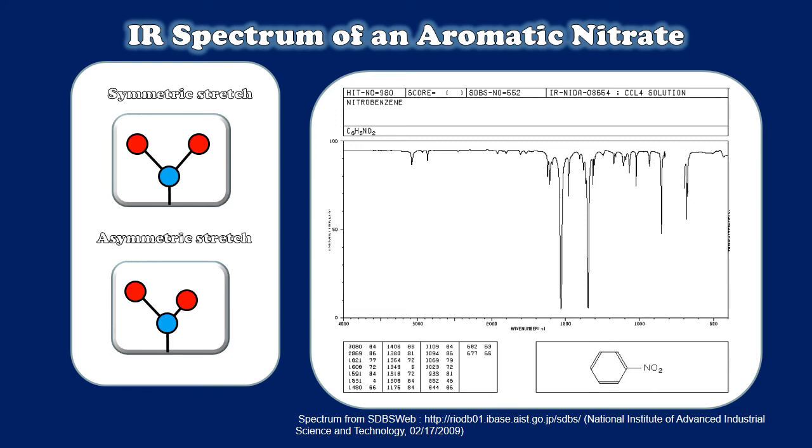So we've decided to use IR spectroscopy to detect nitrate groups that have been added to our bromobenzene molecule. So what do we expect to see here? Well, there are two very important bond vibrations that nitrates introduce into molecules which make them so easy to detect by IR. Those are the symmetric stretch and the asymmetric stretch, shown here. These two different stretching modes have slightly different frequencies and therefore have slightly different absorptions in infrared spectroscopy.